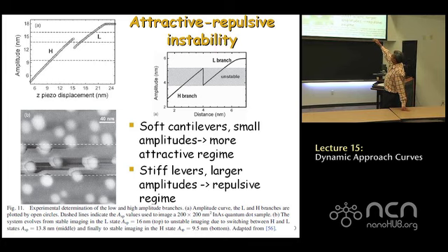What they've done is they've taken images of the sample at different set points. Remember, when you scan in tapping mode, you choose an amplitude and you scan. If you were doing the experiment, what amplitude would you choose? Well, you have a huge variety of amplitudes to choose from, right? You can choose 18 nanometers, 12, 9, 6. Who's stopping you? No one's stopping you, right? You can choose anything. And then the controller is simply going to make sure the amplitude remains constant. However, out of the 3 dashed lines, one choice is not a wise one. The other 2 choices are wiser.